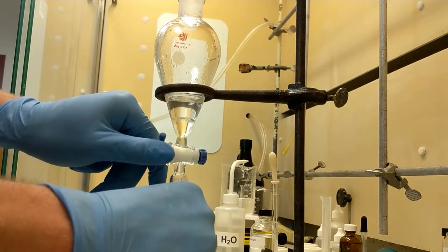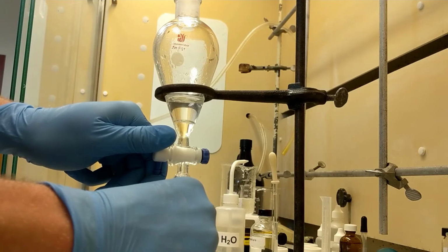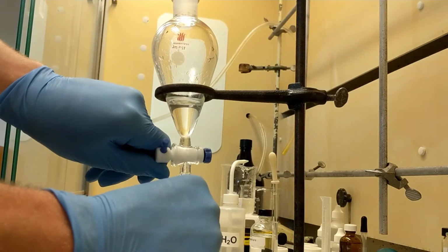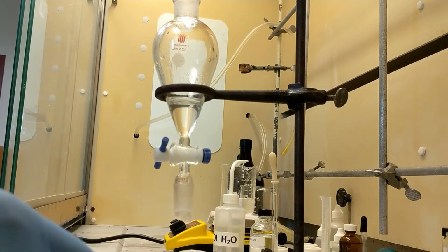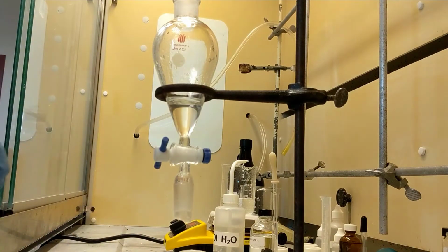There we go. Alright, so I've pulled out the methylene chloride. And now I'm going to do it again, add more methylene chloride and run it again.